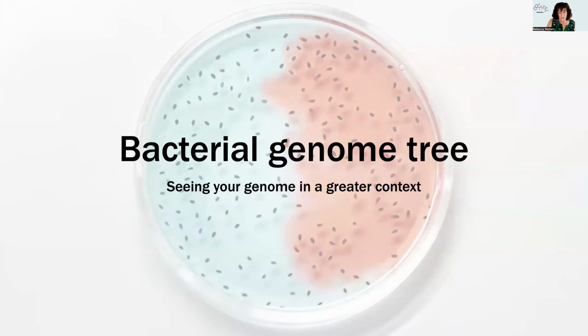You've annotated your genome. You knew the taxon of it if you ran taxonomic classification. You certainly could figure it out if you did similar genome finder once you had it. Even if you annotated at the highest taxon level of bacteria, it would be showing you who it was closest to. But now this is a service where, if I was a genome, it would tell me who I was in the greater world of genomes. Who are my relatives? Who am I closest to?